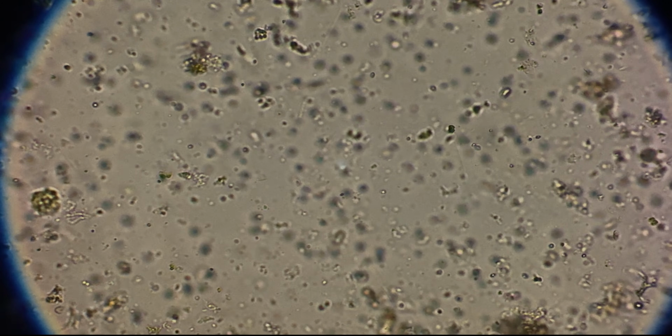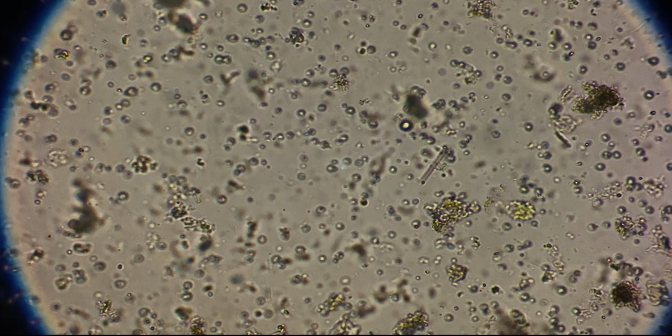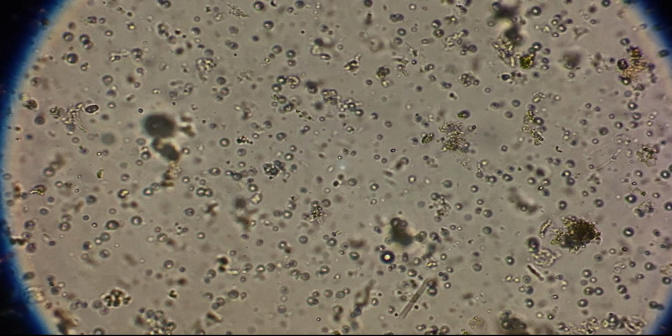And fourth, simple environmental change. Sometimes it's not one single dramatic cause, it's everything at once. New chemicals, new acidity, new pressure on the cell, all happening in the same few seconds. That combination alone could be enough to slow things down. So which one of these is the real reason? Honestly, we can't say for sure just from watching under a microscope. That would require proper lab analysis. But watching this reaction happen live, it's still incredible.